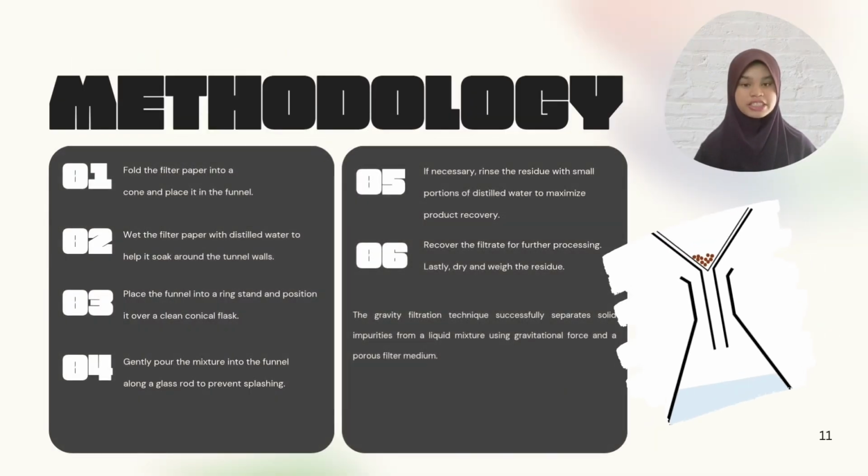Then, rinse the residue with small portions of distilled water. Lastly, recover the filtrate, wait for it to dry, and weigh the residue so it can be recorded in the results.